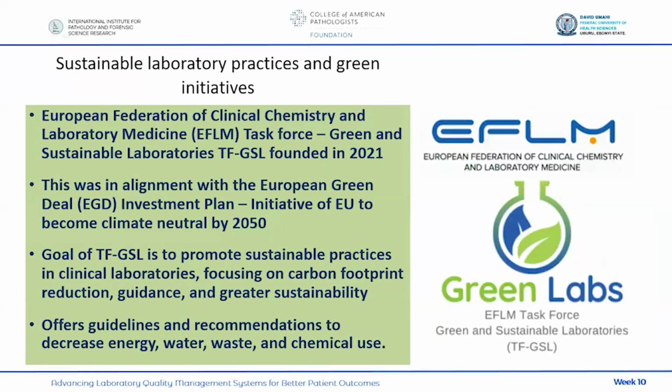And to key into these initiatives, people have already started. The laboratories have already started. In Europe, the European Federation of Clinical Chemistry and Laboratory Medicine have already formed a task force. They named this task force EFLM Task Force Green and Sustainable Laboratories. And this task force was founded in 2021.